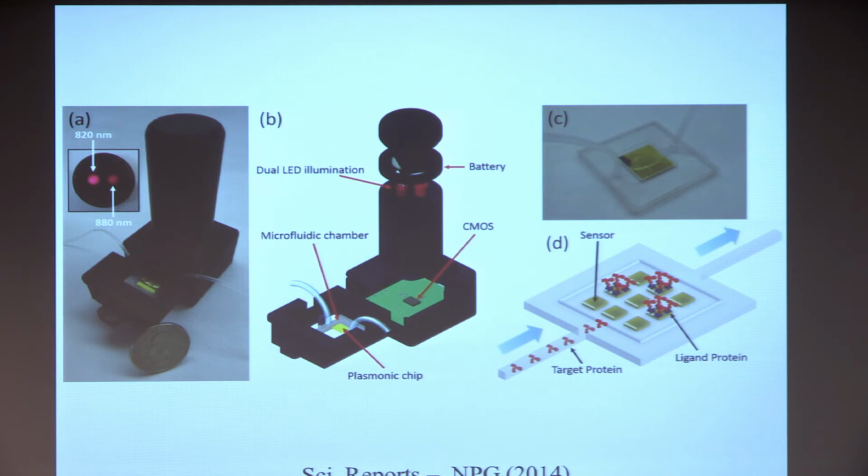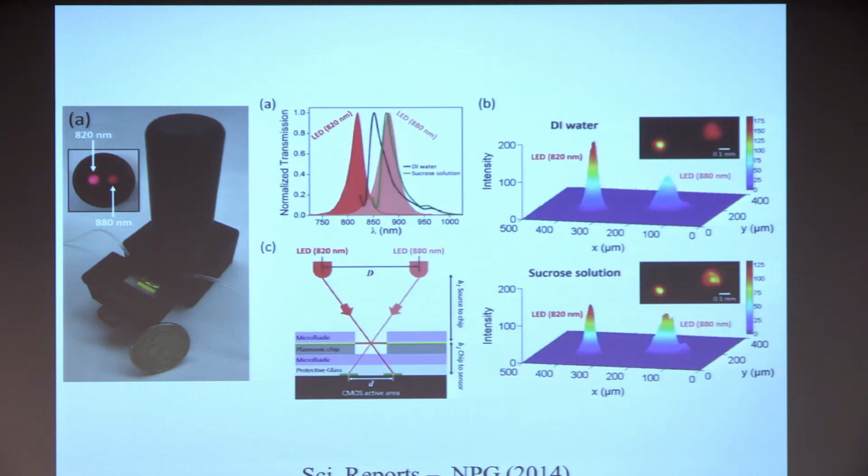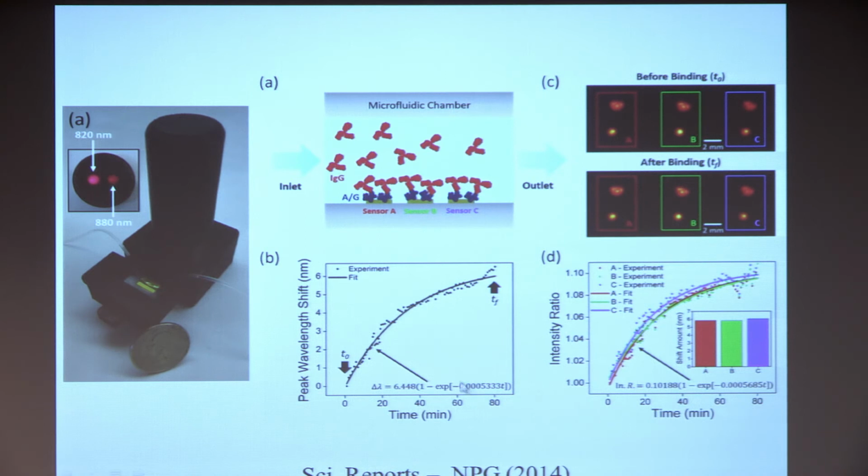It works with similar transmission shadow imaging based approaches to give you these binding kinetics, this time at the molecular level. So we're now detecting monolayer formation on a surface functionalized gold nano aperture array, and you can functionalize it for different DNA or different proteins specifically, so that you can understand within a complex specimen the amount of binding to different regions in the form of a microarray. But the readout here comes in a very fast and obviously cost-effective and field-portable implementation.